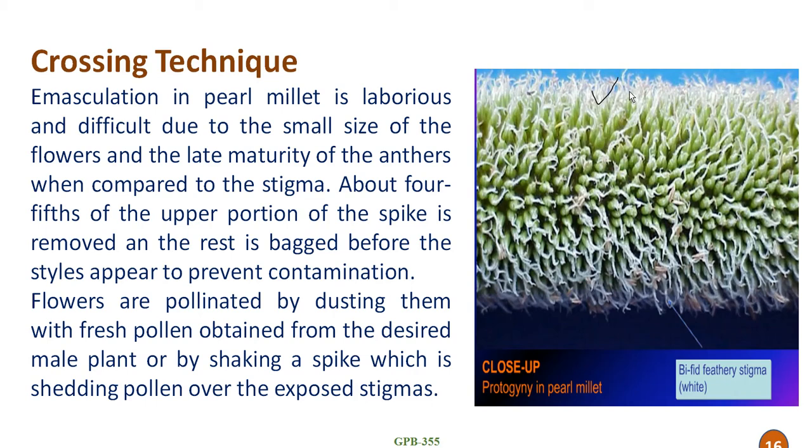Emasculation is generally done to avoid the effect of pollen in a bisexual flower, where the pollen contaminates the female. But due to the difference in maturity timing, the gynoeciums mature first, and in the bisexual, perfect flower, the anthers are not mature enough. So we can easily pollinate this stigma using foreign pollen from another male parent, which we can use in hybridization.